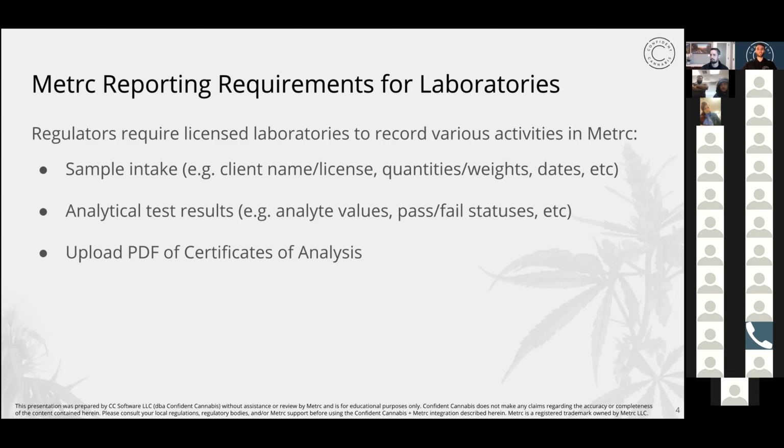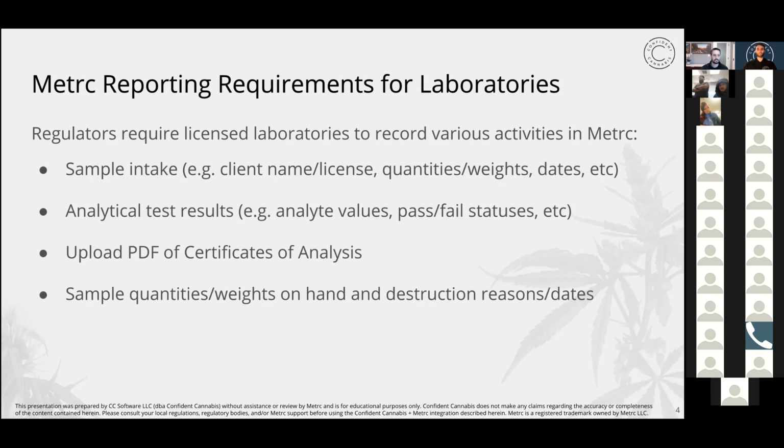They also want you to upload the PDFs of the certificates of analysis to Metrc. So quite a bit of clicking there. And then finally, the sample weights on hand and destruction reason dates. So as you consume sample material during your testing, they want you to tell Metrc how much you have at the end of the day.